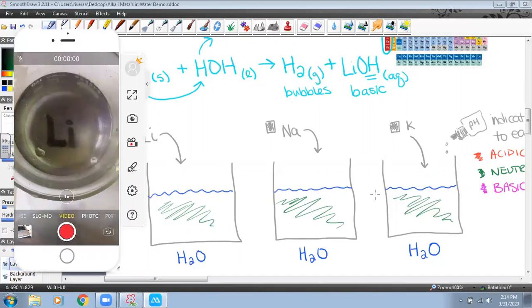Oh, I shouldn't stand right above it. Excuse me. And depending on how good your camera quality is or your computer screen is, you might even see that color change from green to purple.